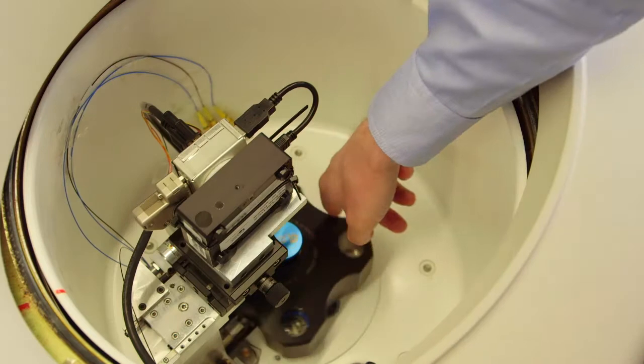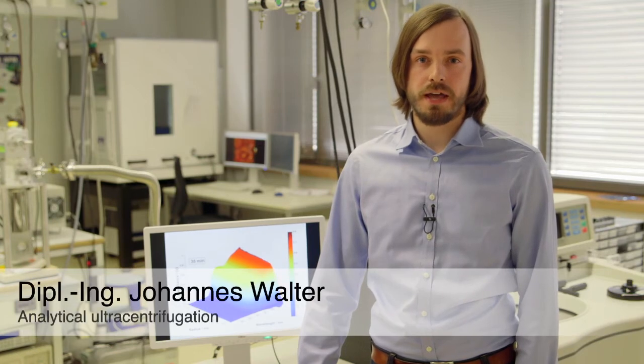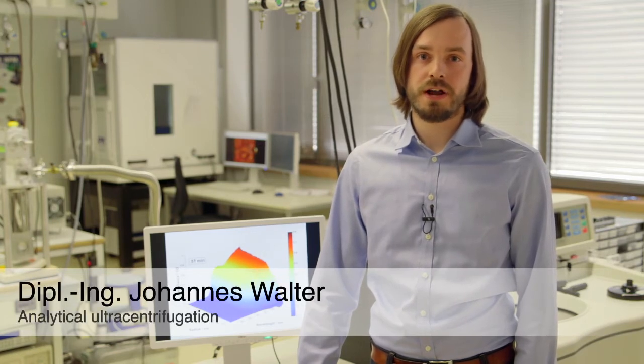What is special about our centrifuge is an integrated spectrometer. It uses multi-wavelength detection by scattering and absorption in order to characterize the sedimentation behavior. This experimental setup allows the simultaneous multidimensional analysis of particles. That means characterizing size, shape, and optical properties at the same time without losing accurateness or resolution.